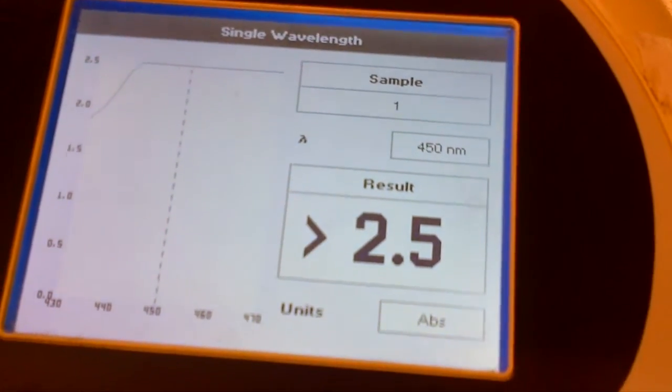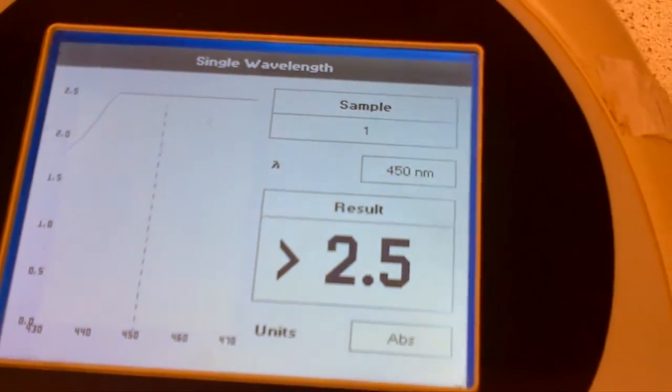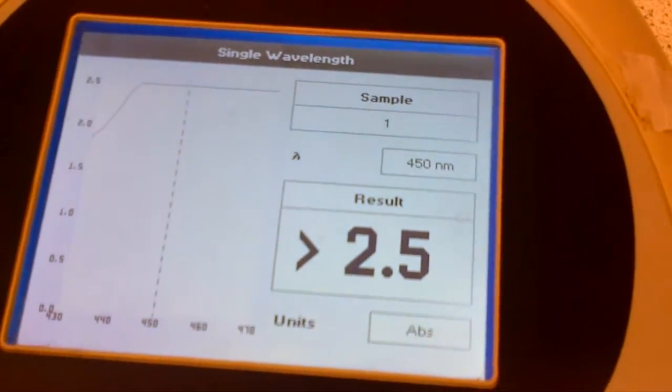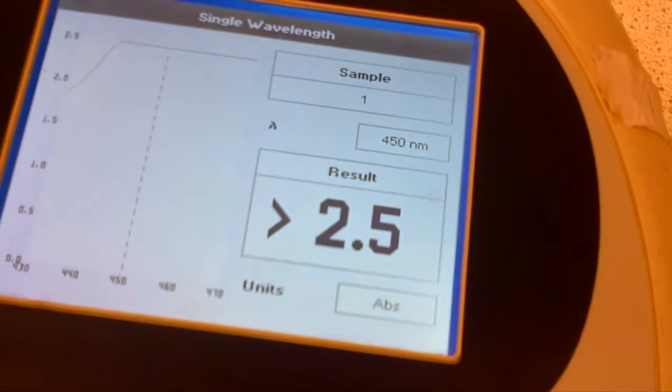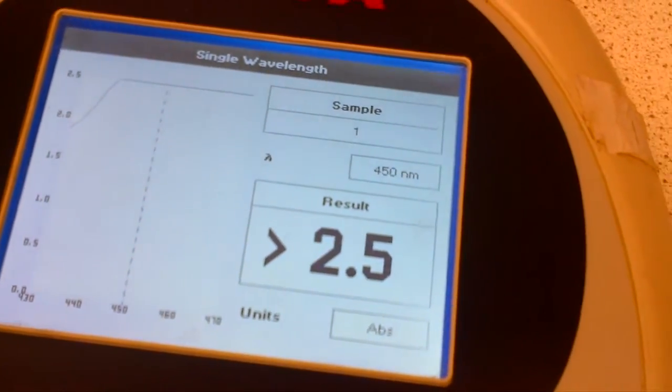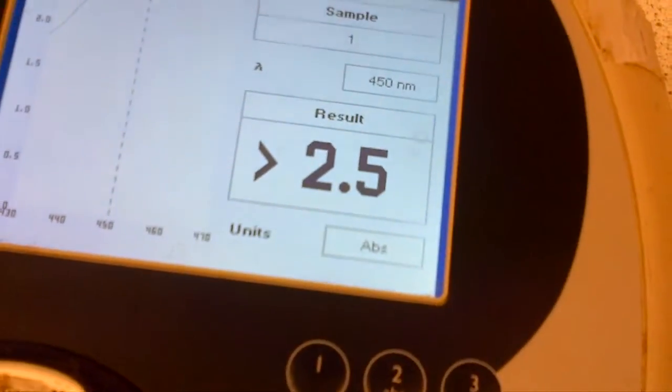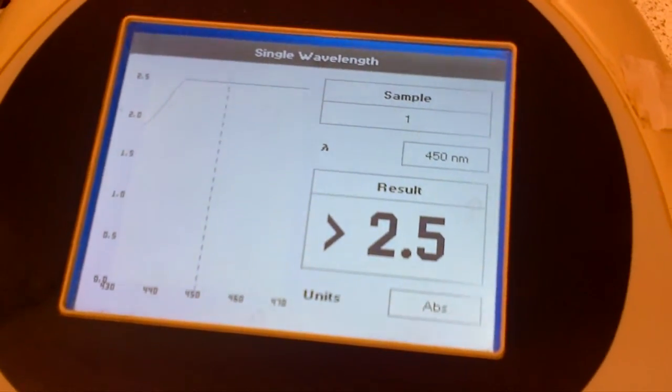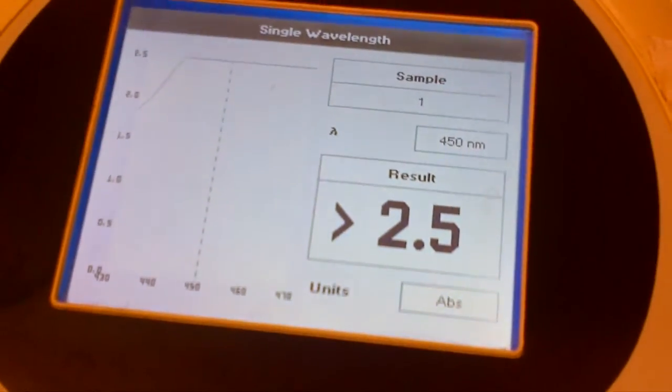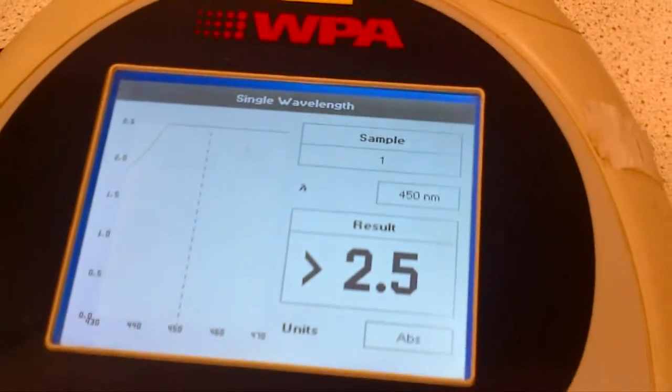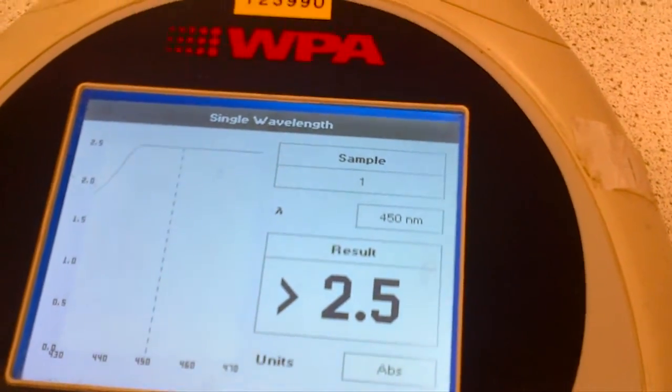So once it's calibrated, first with water in the first instance, you're now ready to keep putting additional cuvettes of different concentration in, as it says in your practical, and keep pressing the green button. You do not have to recalibrate the machine before every reading, and that's your first simple instruction of how to use the UV spectrophotometer in lab 101.